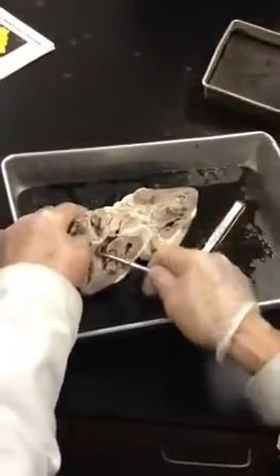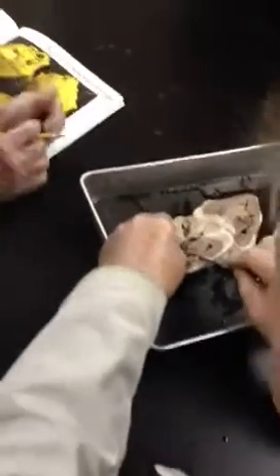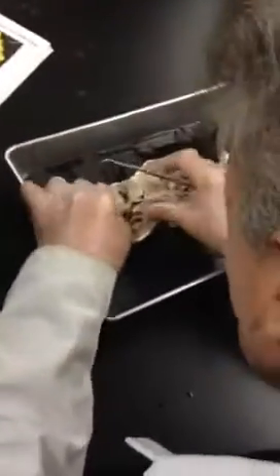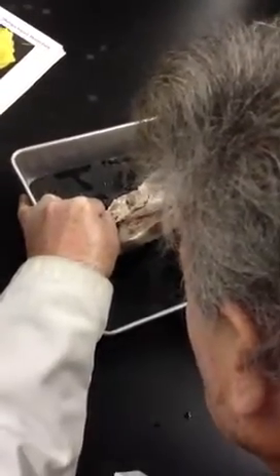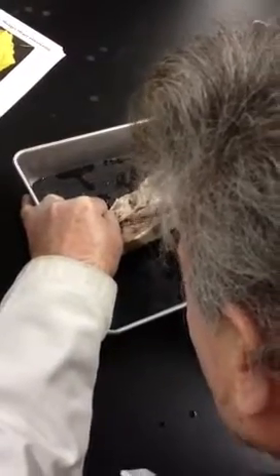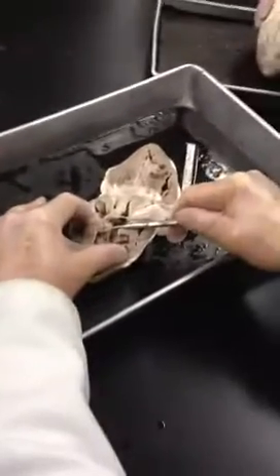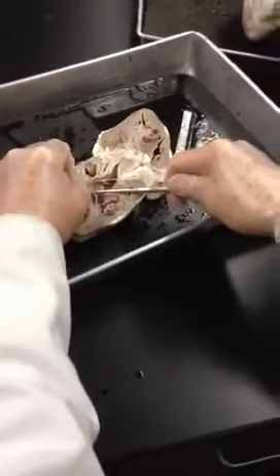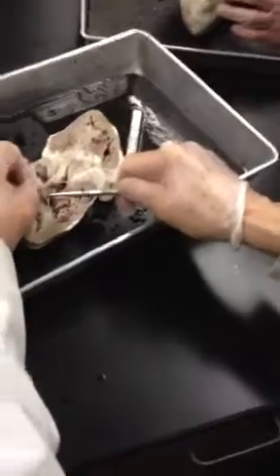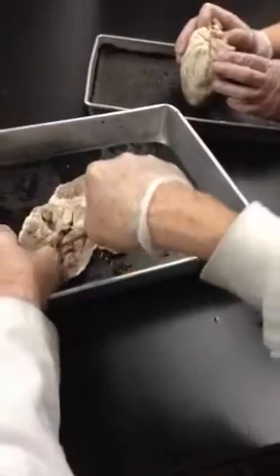The chordae tendineae — let me do this again. It looks pointed, like a cusp here — I'm outlining it like this. From here to here, that's one. Then this should be two — I'm pulling up on it, you see? That's two. And then back here should be three. So that's the tricuspid valve, and you can see the chordae tendineae — these are tendons in the heart.